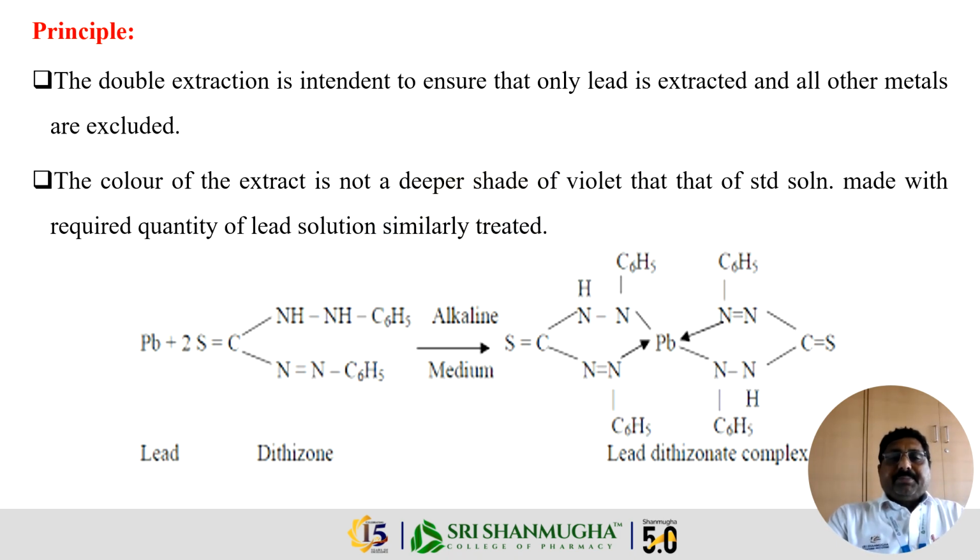Finally, the color obtained is compared with the standard solution prepared using a known amount of lead. If the sample color is not deeper than the standard, the sample passes the test. Otherwise, it fails.